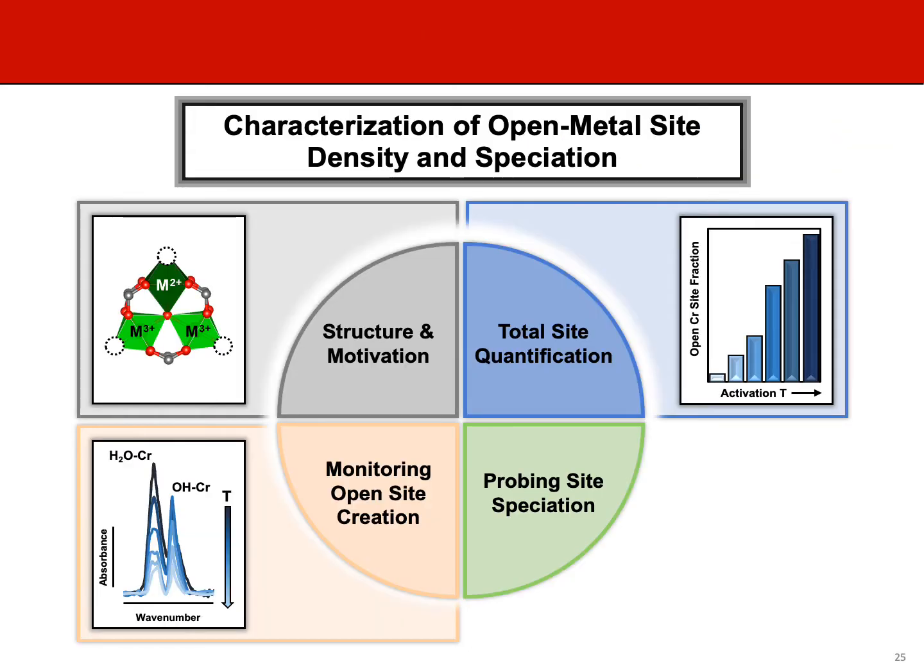So what I've shown you is not only that we can get meaningful trends and test out our hypotheses, but also that we can compare infrared spectroscopy data and irreversible water adsorption data to verify the site counts that we obtain using these two methods. Now, what this opens up the possibility for is to systematically probe not just the total number of open metal sites, but also the number of sites that are in a specific oxidation state on this MIL-100 node.